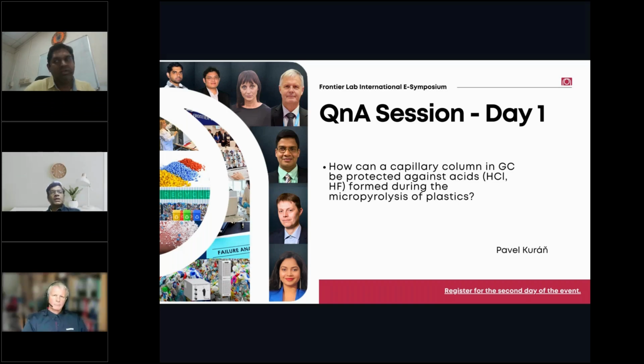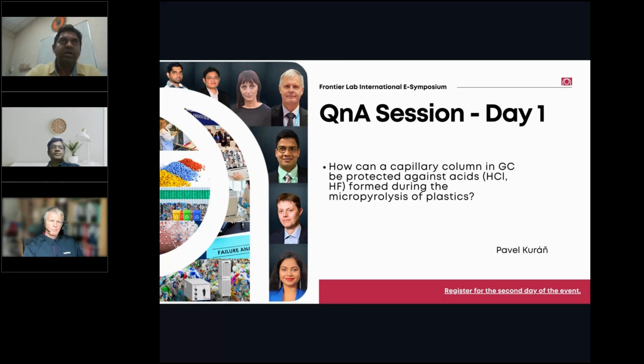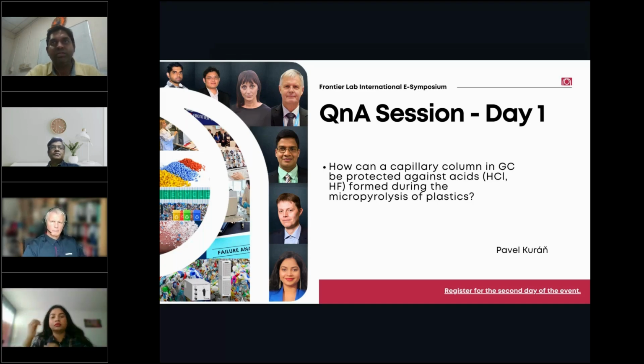When you say that the sample mass has to be only a few milligram or microgram scale, the natural question then is how representative can the sample be, especially if the sample is very heterogeneous. This may be applicable both for pyrolysis studies, where we are now expanding the application of pyro GCMS to studying more complicated feedstocks like solid waste, where a small dot or a pinch of sample may not be really representative of the whole solid waste, or even for your case of weathering of samples. So how do you justify this and convince people in the field that this could still give very valuable information? I think all of you can respond and share your views.